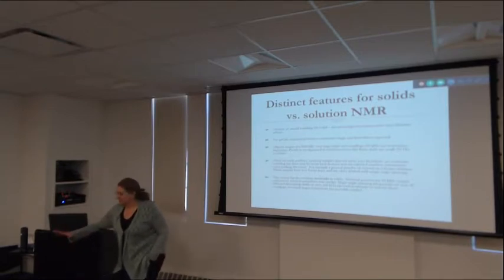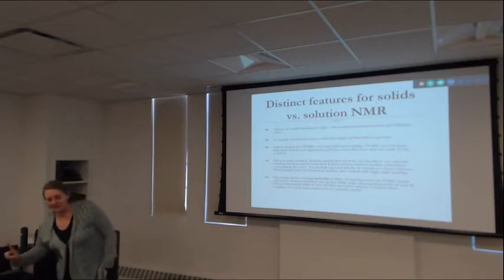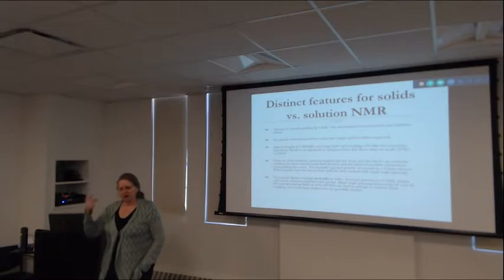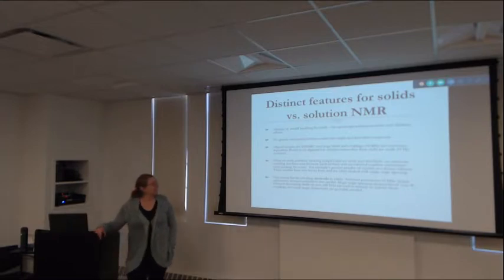So every experiment that we talk about, if you just feel like it helps you to stay awake to ask a question, most of us, that's true. If you just listen and you don't talk to me, you might start to fall asleep with all the equipment. Here's a question you can always ask. Do you need to use some isotopes to get rid of some couplings to make it work better? How are those networks of couplings affecting this experiment? It's always a good question for solids NMR.